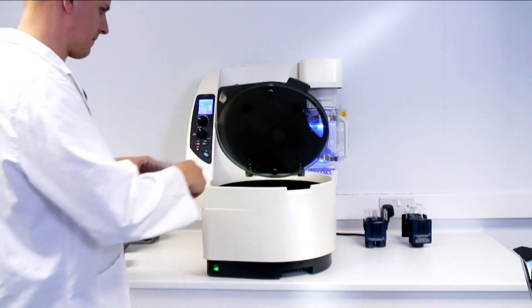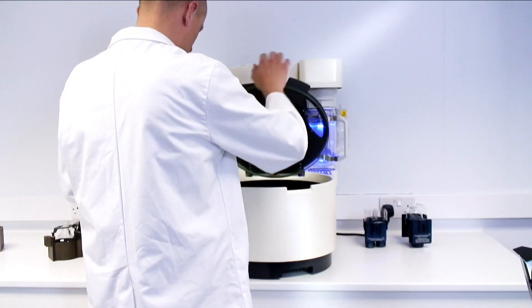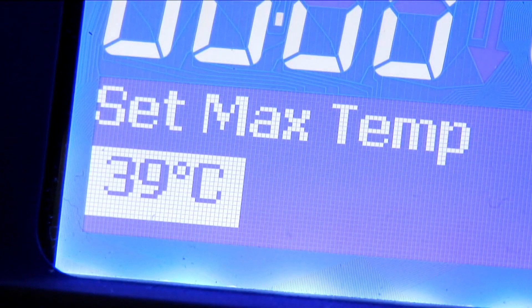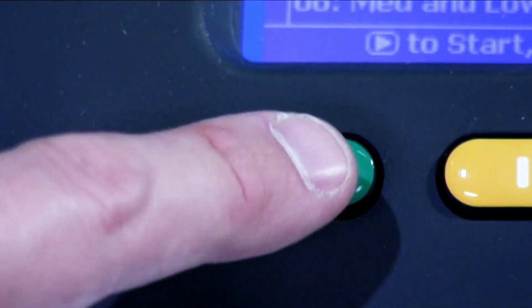Using the EZ2 is simple. Place the samples into the appropriate sample holder, load it into the system, close the lid and set the maximum safe temperature for your samples. Select the appropriate method and hit start.